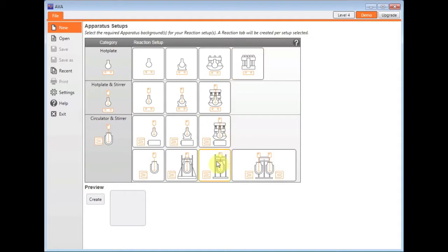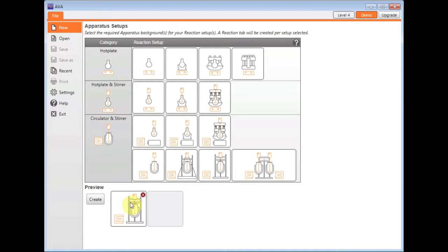I'm going to use a Reactor Ready as my example, which when I click on it appears down in my preview. If I click Create, that's going to take me to a new window.